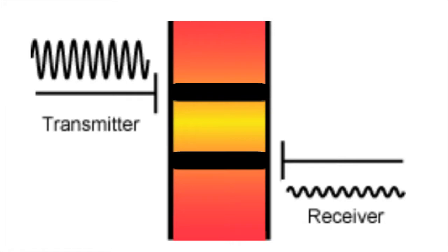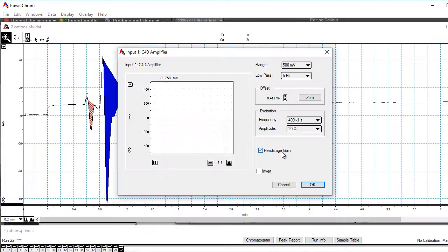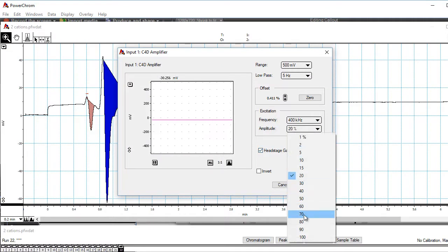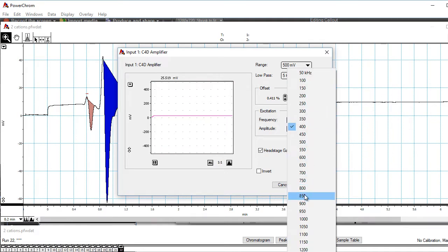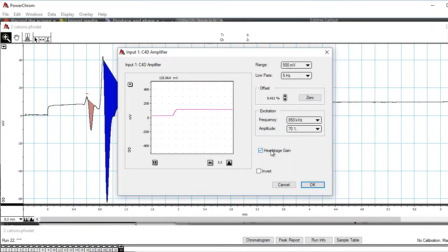The EDACC4D lets the user select the amplitude and the frequency of the sine wave. Using the optimum amplitude and frequency is important to get the best sensitivity from the C4D detector. In PowerChrome software, for example, the excitation amplitude can be selected here, the excitation frequency here, and the head stage gain just here.